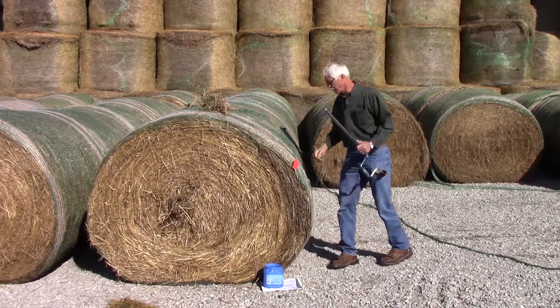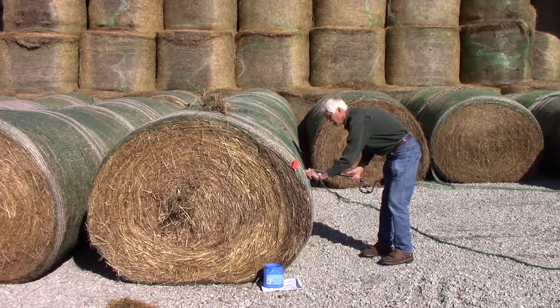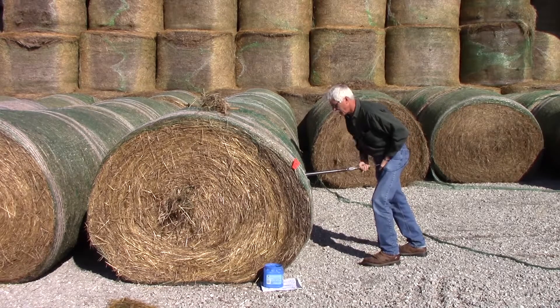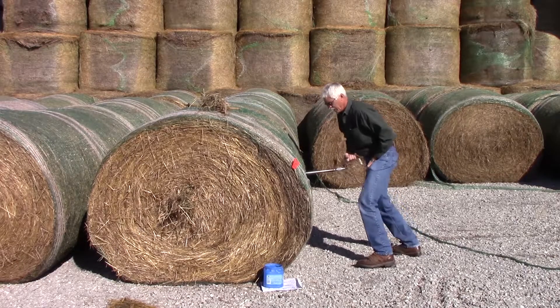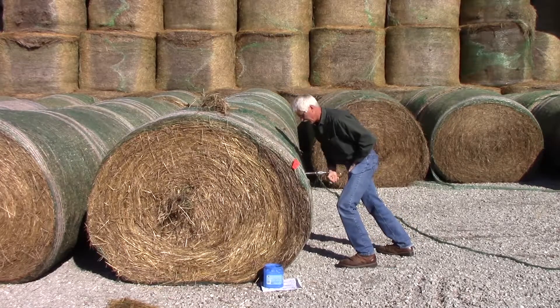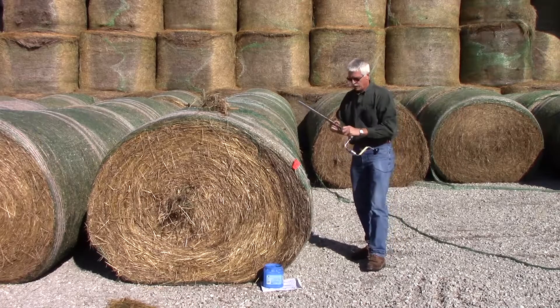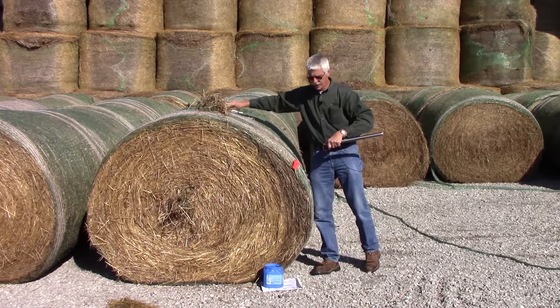To collect the sample, we separate the net wrap, or in the case of haylage something that's wrapped, we make a little cut in the plastic and then simply push our coring unit into the bale. This will go in about 18 inches or so. They do make extensions so you can go deeper into bales if you want to. Then we take our hay probe loose.